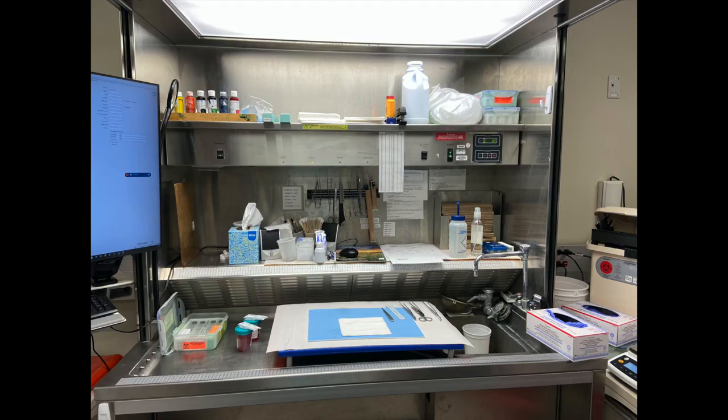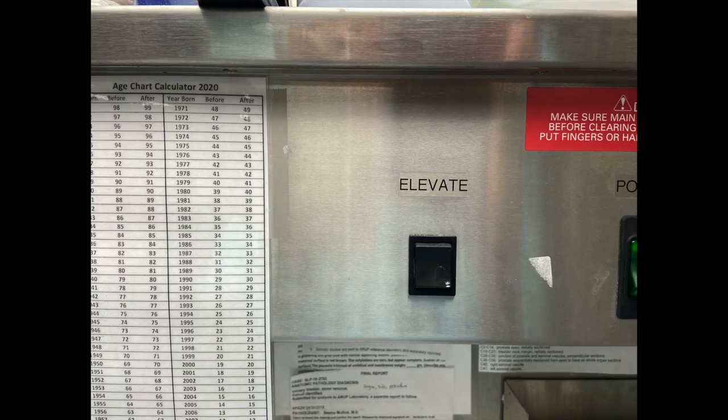Good elevation of the grossing bay cutting surface is important. My grossing bay goes up and down — a lot of the newer ones do. If you don't have that, find your sweet spot keeping your arms at 90 degrees from the cutting surface. I use a four-inch elevated grossing board with little four-inch legs underneath it. It gets it up out of the well of the grossing bay and can also elevate the bay itself, keeping everything closer to my face and eyes so I can see, and it reduces fatigue for arms, shoulders, and back from leaning over for long periods.